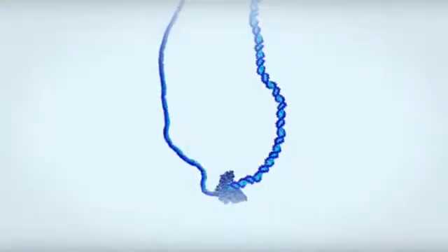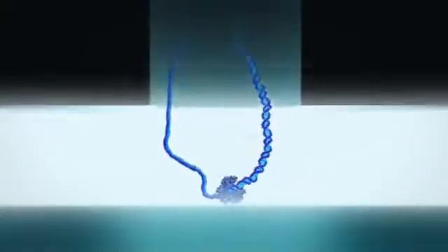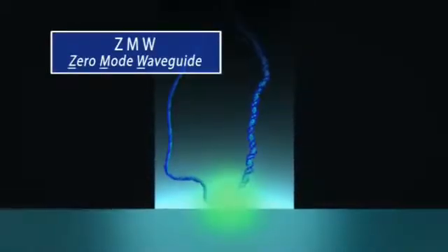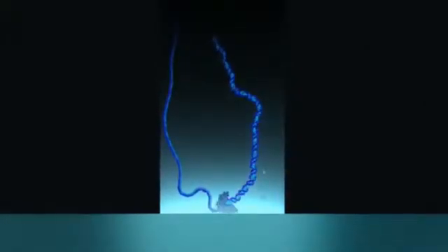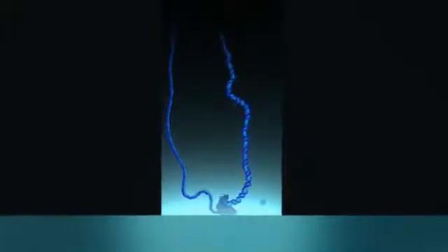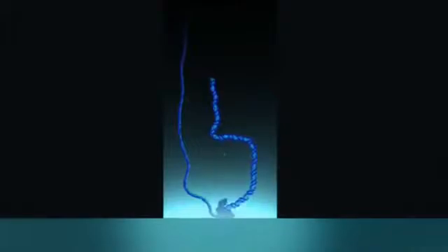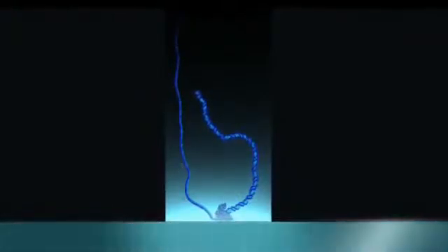The second key technology is a nanophotonic visualization chamber called the Zero Mode Waveguide, or ZMW. It enables observation of individual molecules against the required background of labeled nucleotides, while maintaining high signal-to-noise. The ZMW is a cylindrical metallic chamber approximately 70 nanometers wide that is illuminated through its glass support, creating an extremely small detection volume, just 20 zeptoliters.